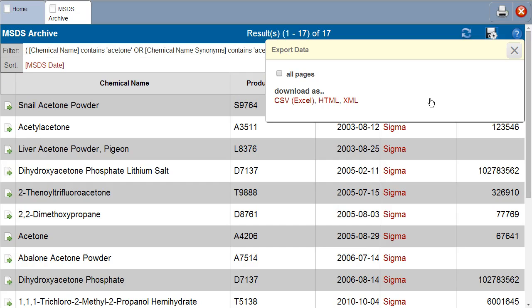You and your users will eventually configure searches for records they care about. Perhaps you care about what class 3 and 4 flammable liquids are stored at a specific location. You could perform a search and add this filter, then save the report. After saving the report, a direct link to that report will appear on your dashboard, and you can easily load it at any time with the latest data in the system.